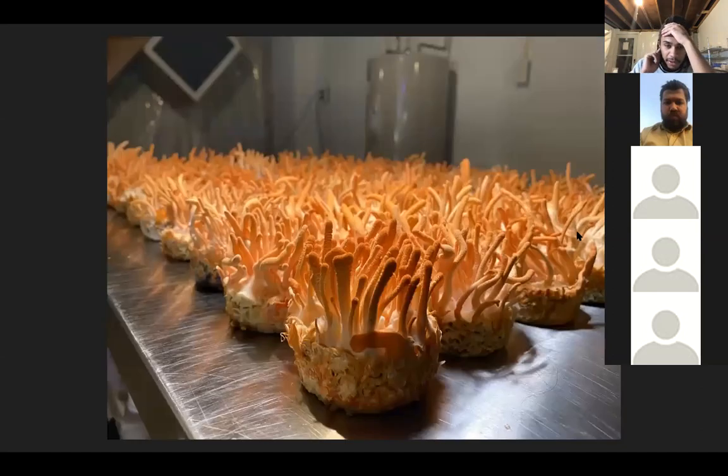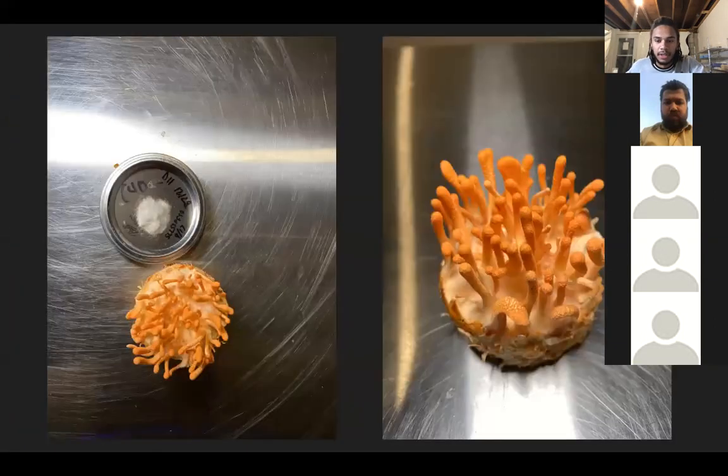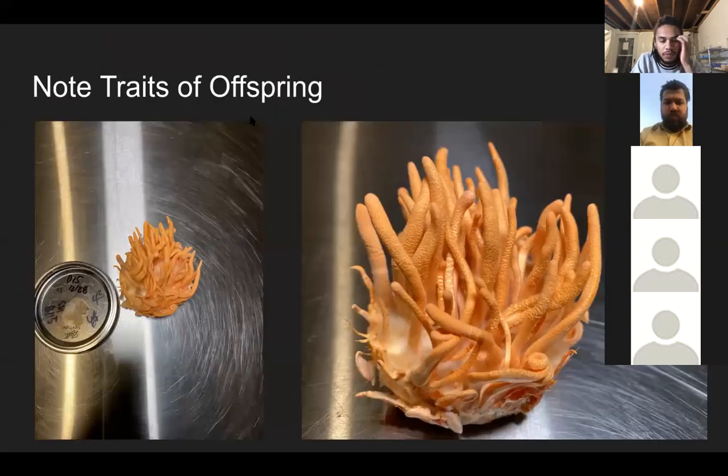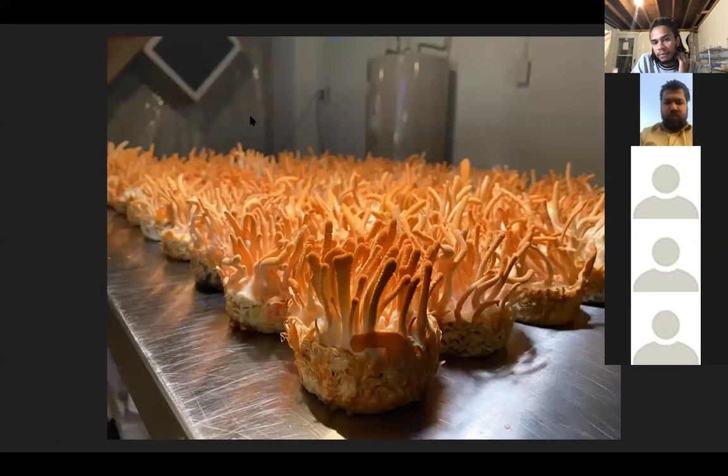So those were all the ones I harvested from one of my last breeding trials. I think I harvested these in like February. So there were a bunch of different genetics. And that's why I grow in jars. I grow in jars just for testing my genetics. So now that I found all the ones that I like, I go back to the drawing board and I breed out the parents that I like. And if I need to do commercial cultivation, I'll take out the best producing ones. Like this one is one of my best producers. And this one was one of my best producers. So I put those two for commercial cultivation just to make me some money while I'm doing my more breeding trials. And I go back and mix the parents that I like.